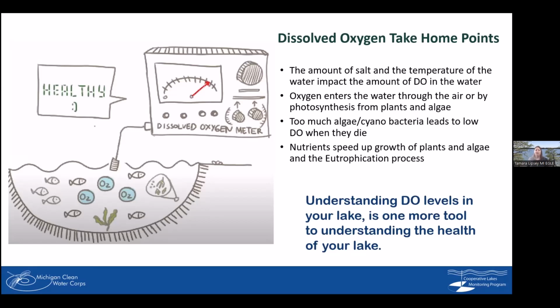The DO meter you will receive doesn't look quite like this one, but it will allow you to measure dissolved oxygen and temperature.